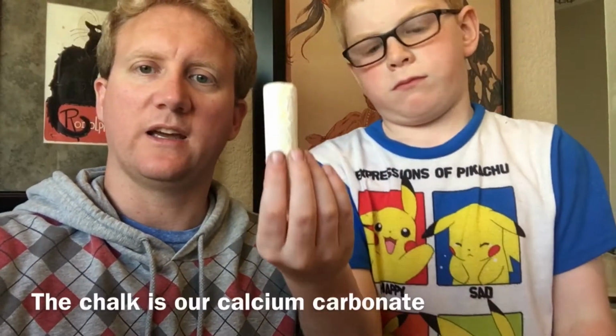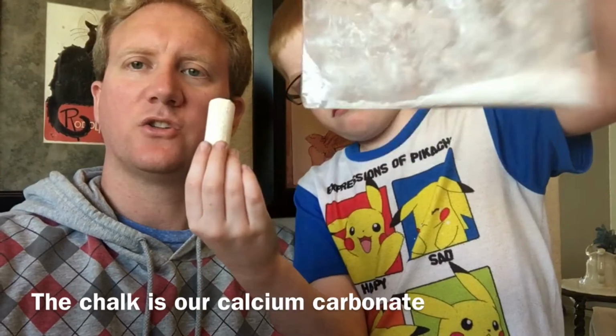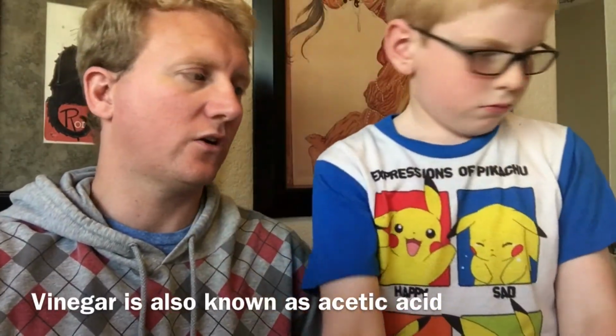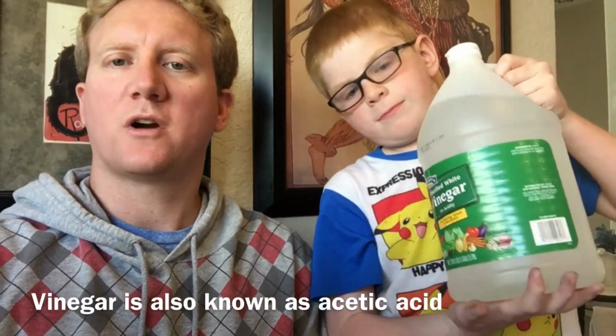water. All right, so for our demonstration today, I brought my helpful assistant, Phineas, over here, and he's going to help us go through some of this. So first, we've got some chalk, which we have already crushed up into a powder so it'll dissolve faster. We've also got vinegar that we're going to use as part of the reaction, because no matter how hard I tried, I could not get any hot lava. There's our vinegar right there. We'll do that in just a second.